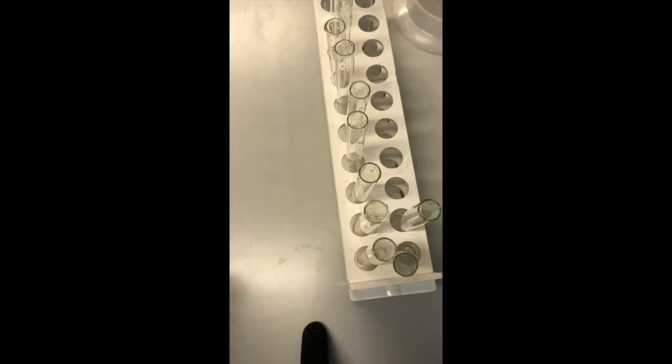In this exercise you have to wash the equipment very precisely. You remember in the tubes there was white sediment, so you have to wash all the tubes with the brush.